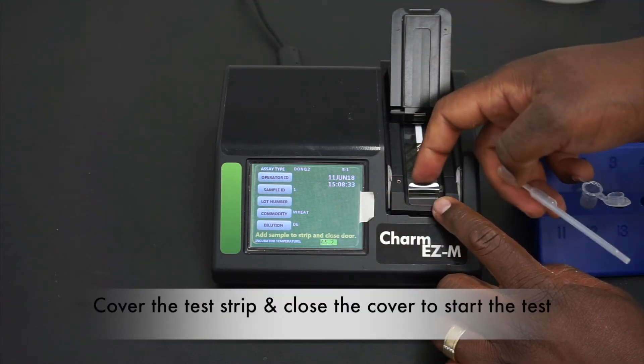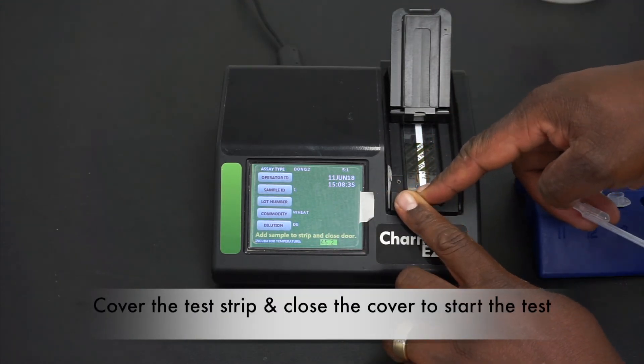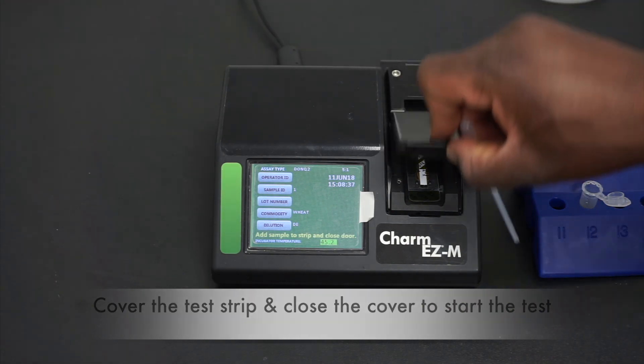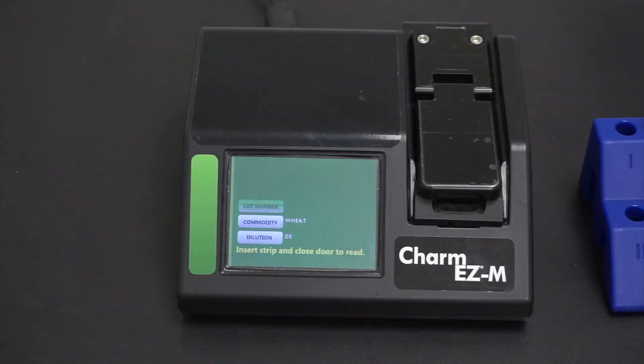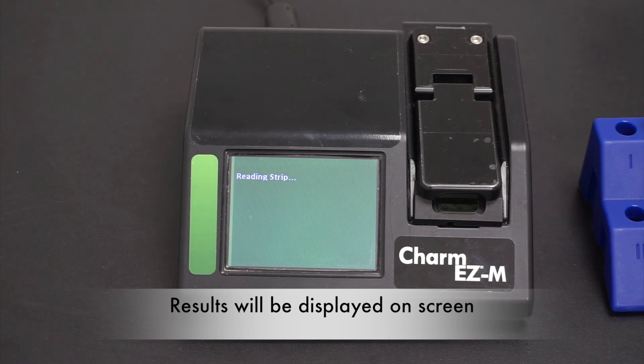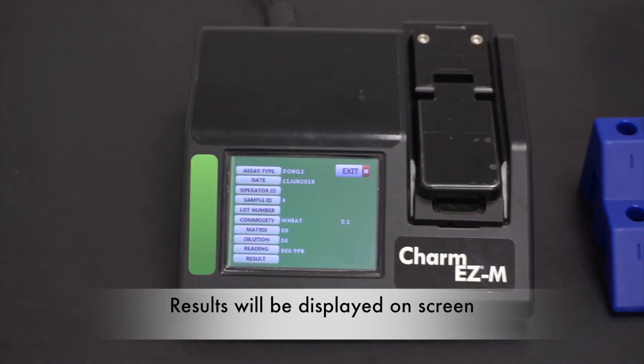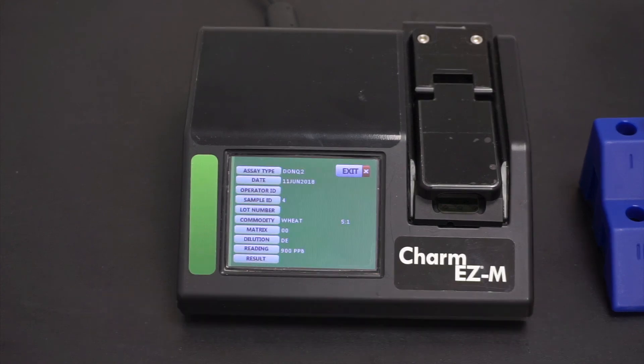Cover the test strip and close the EZM cover. The result will then be displayed on your Charm EZM reader and automatically saved.